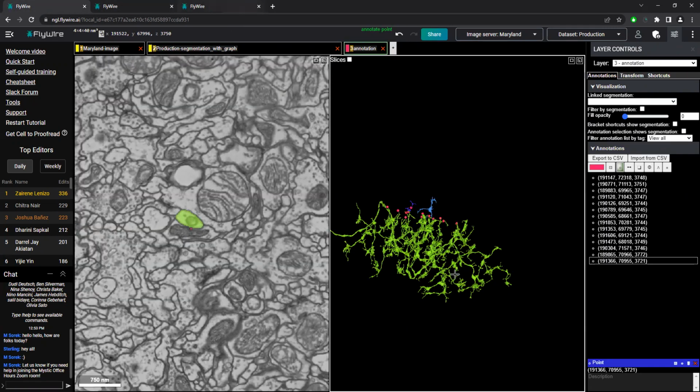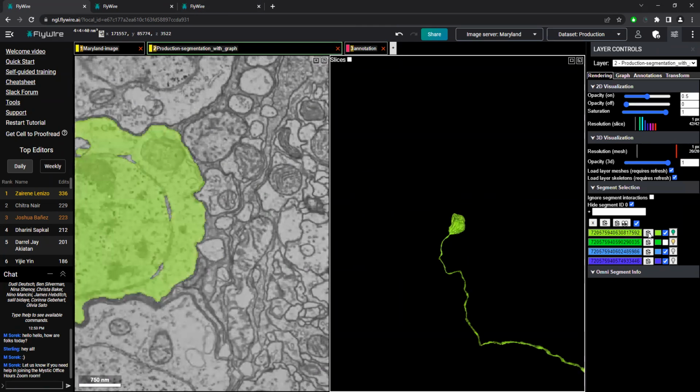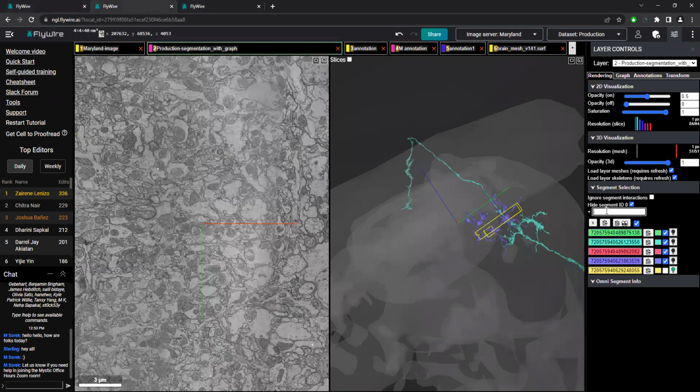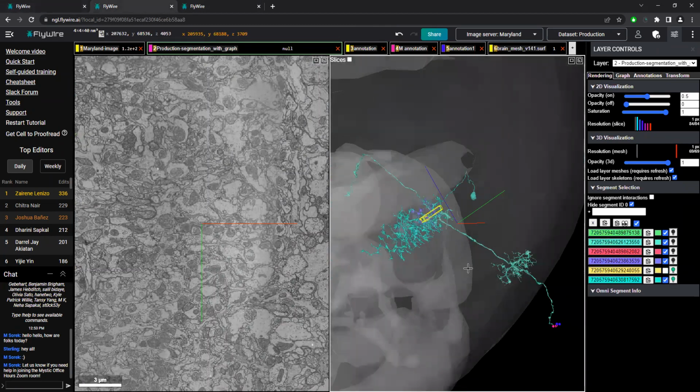So if we wanted to, we're like, oh, I completed this one, you just hit this little clipboard, and that'll copy the segment ID, and you could just pop it in, and then you could keep a little Neuroglancer link for yourself that you just add to, of all the cells that you've completed over time, if you desire. But that's your own note keeping that you'll have to do, and we don't want you guys to have to do that, but just if you're feeling like it.